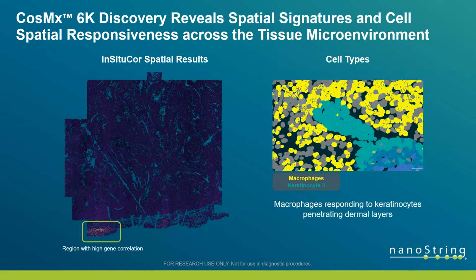And then we group them spatially within correlated genes as well. So this hotspot shows an uptick in the genes that are responsible for antigen presentation, lymphocyte chemotaxis, and cytotoxicity across this cluster of keratinocytes as well. So really, really nice way of being able to look at non-trivial specific markers in gene correlations.